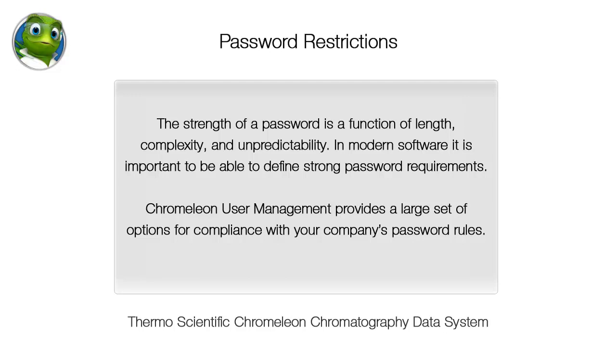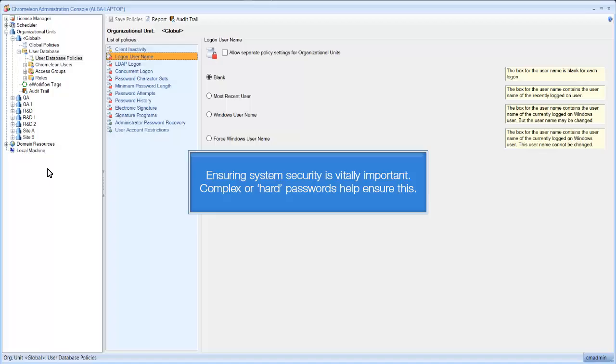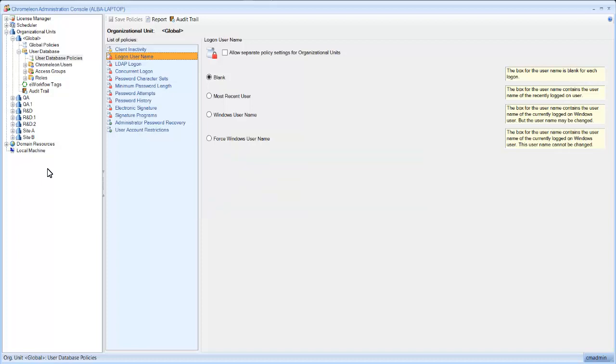Chromeleon User Management provides a large set of options for compliance with your company's password rules. Ensuring system security is vitally important. Complex or hard passwords help ensure this.